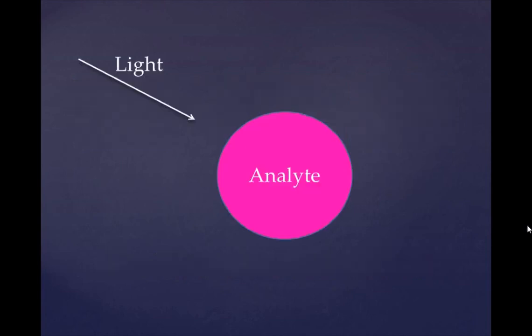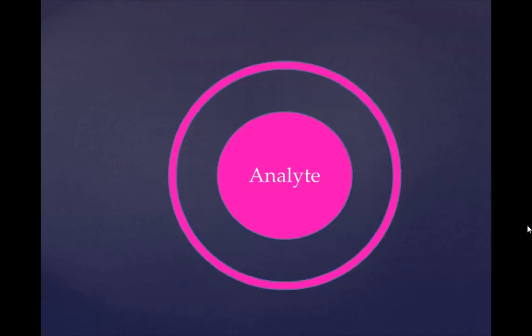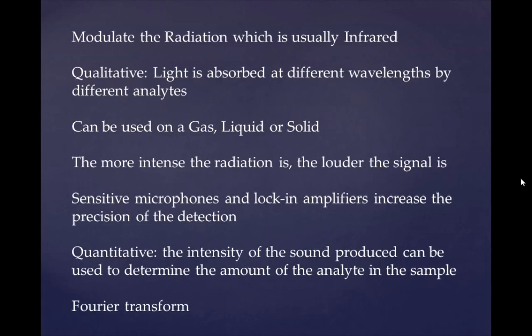See here, light is absorbed by the analyte, which expands, and then it will contract as it releases the energy thermally, which produces sound waves, like the one shown here as a pink ring. The photoacoustic effect is the driving force of photoacoustic spectroscopy. The radiation must be modulated so the molecules may expand and contract repeatedly, and the radiation must be intense enough to give adequate sensitivity to the spectroscopy.